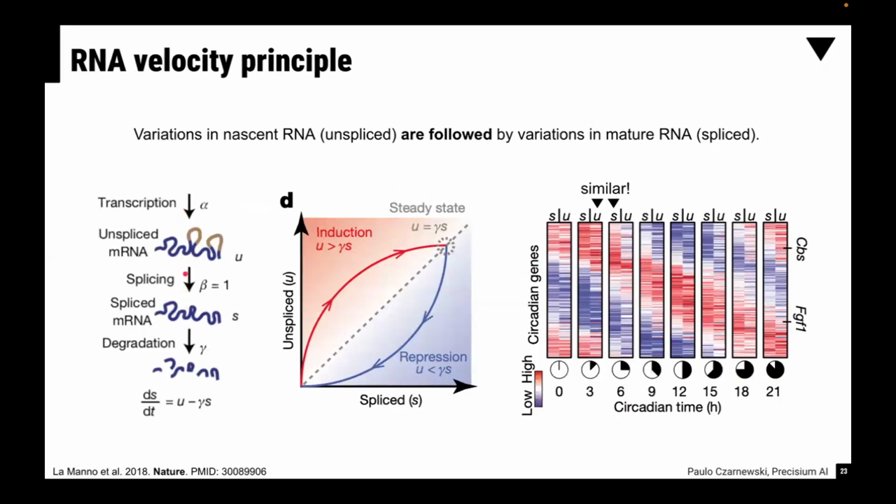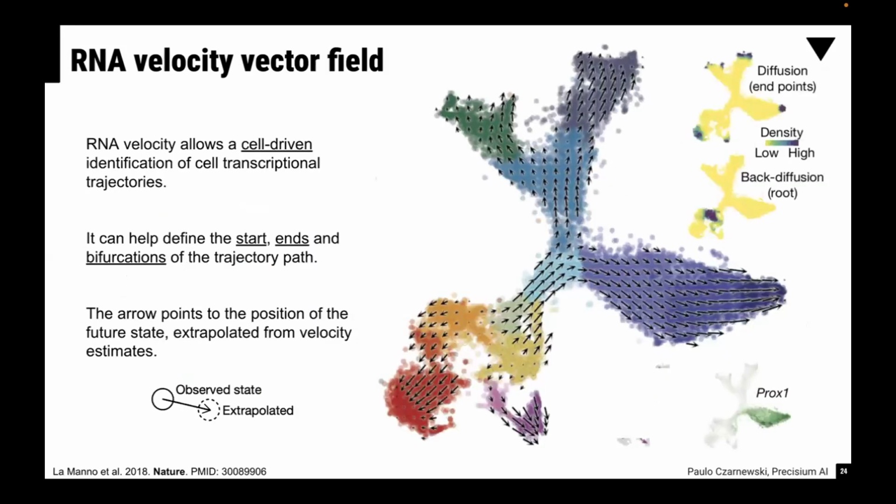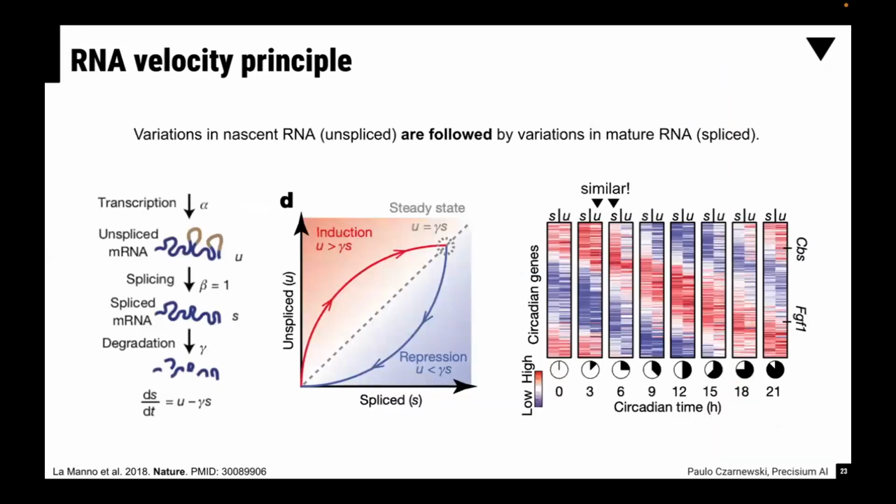Some genes have this splicing pattern happening all the time. Some have that deactivated for some reason, because of a dicer problem and so on. So I don't think any of these methods can actually handle many of these complex tasks.